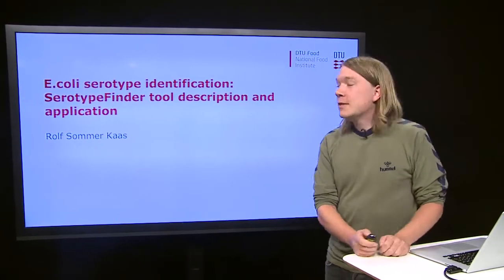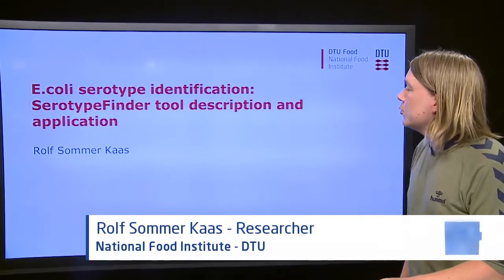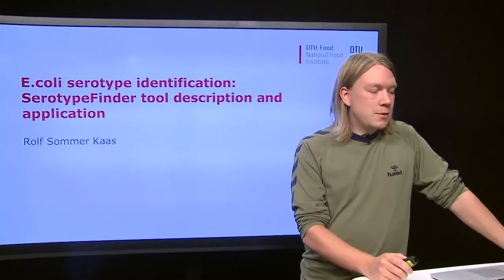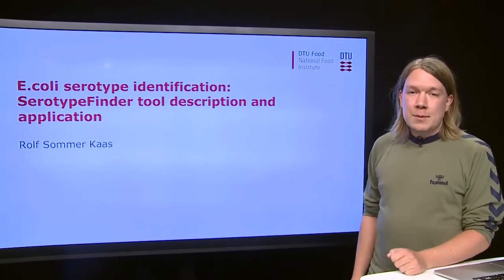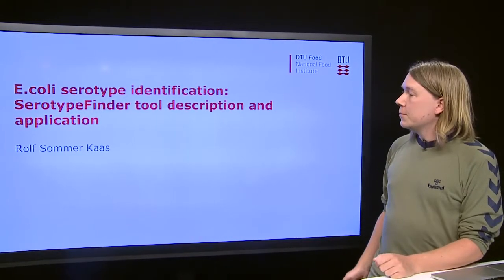Welcome to this session entitled E. coli serotype identification, SerotypeFinder tool description and application. My name is Rolf Sommer-Kaas. I'm a bioinformatician with the National Food Institute here at the Technical University of Denmark. In this session, I'm going to talk about SerotypeFinder, which is a tool to serotype E. coli from sequencing data.